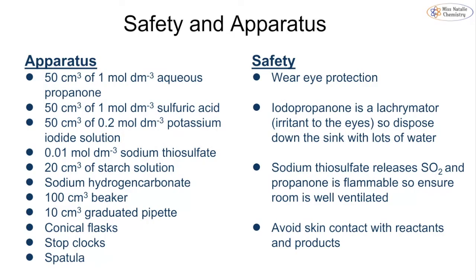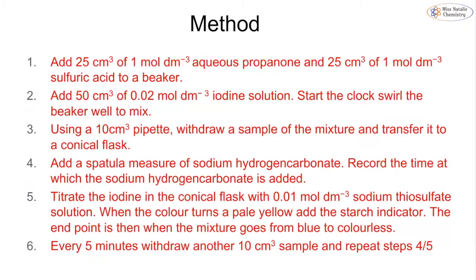For safety, of course, we're going to need eye protection. Iodopropanone is irritant to the eyes, so it can cause your eyes to water. So when we are disposing of it, we need to make sure that we rinse it with lots and lots of water. Sodium thiosulfate can release sulfur dioxide, and propanone is very flammable, so we make sure that the room is extremely well ventilated. And of course, we want to avoid skin contact with any of our reactants or products.